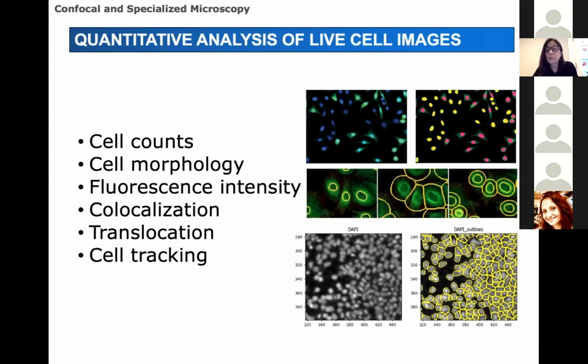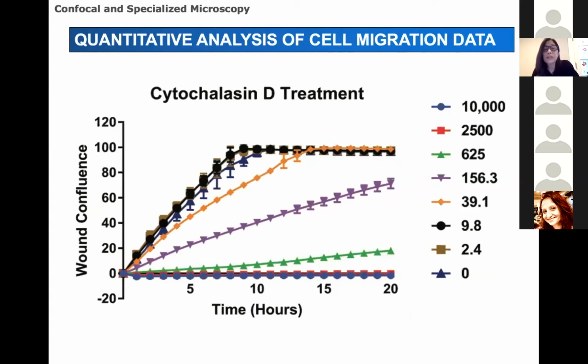of fluorescence within cells. And so here you can see quantitation of the analysis of cell migration in movies similar to the one I showed you previously. So what you're looking at is analysis of migration of either untreated cells or cells that are treated with different concentrations of cytochalasin D, which inhibits cell migration by perturbing the actin cytoskeleton. You can see that we can get good quantitation of cell migration, as well as a dose-dependent decrease in that process as a result of cytochalasin D treatment.